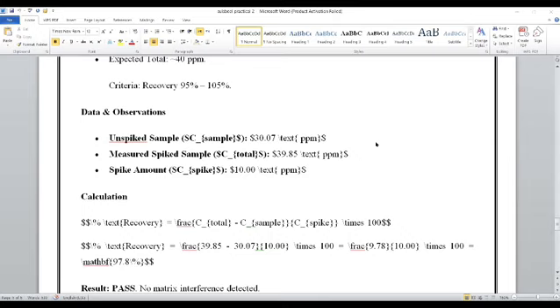Final conclusion. The analytical method TM/Zinc/01 for zinc determination in acid chloride plating baths has been successfully validated. The method is linear over the working range, shows excellent precision, provides accurate results without matrix interference, and is highly sensitive. Approval for routine use: based on the validation results, this method is fit for purpose, compliant with ISO/IEC 17025, and approved for routine quality control analysis.